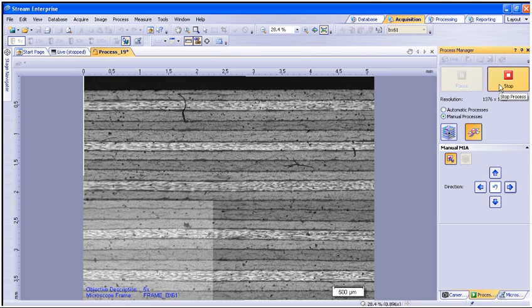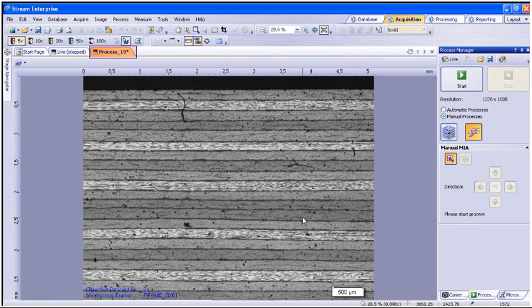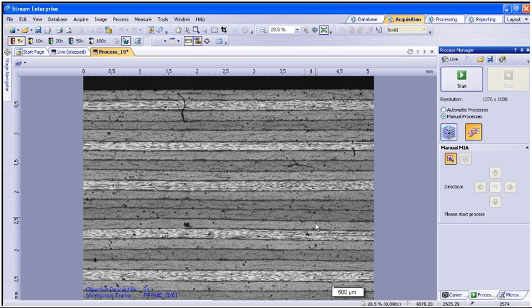Once the stop button has been pressed, the software will finalize the stitching of the last image and generate a new MIA image file. You now have a fully stitched image that is calibrated and ready to take measurements on or place into a report.